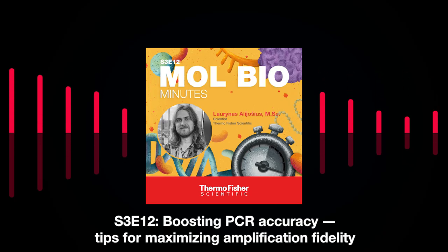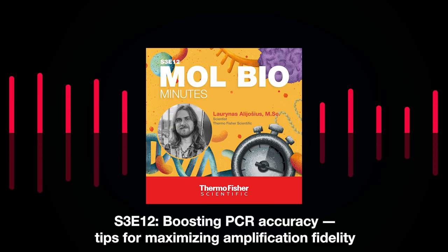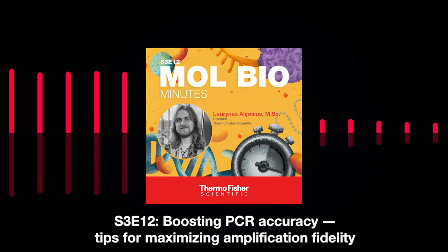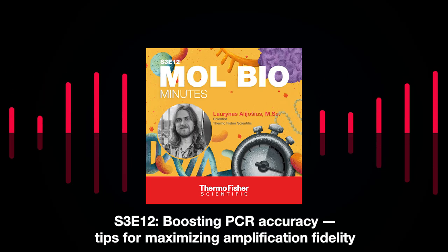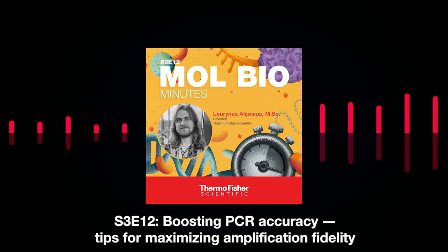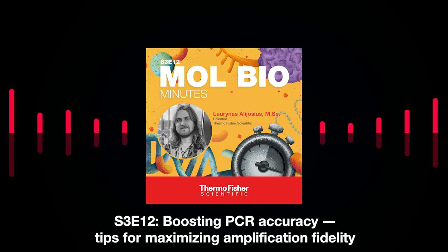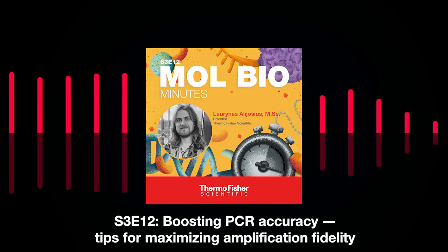Some time ago, I wanted to make some specific DNA to use for my model system for my experiments. I did some PCR from a biological template, then I cloned the amplified DNA, and then I sequenced it. But it turned out that my DNA was wrong. It had multiple errors in the sequence. I was thinking, what should I do then?